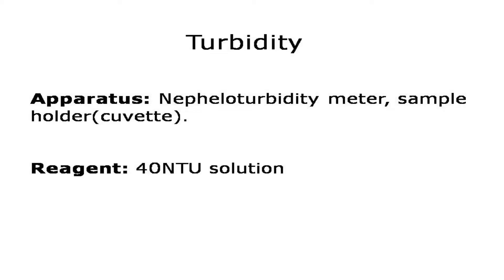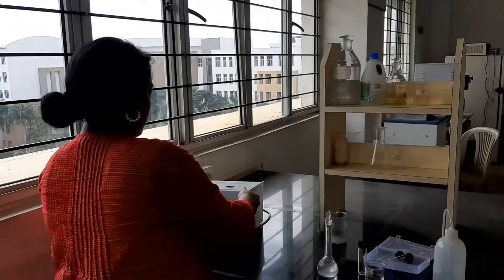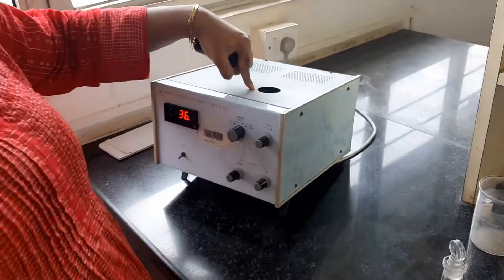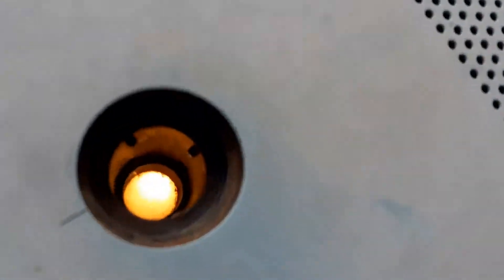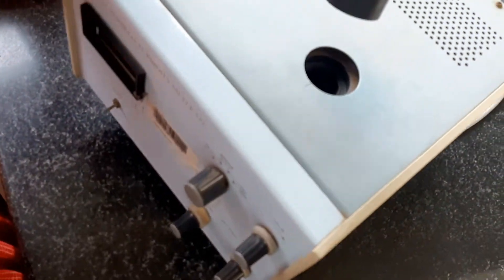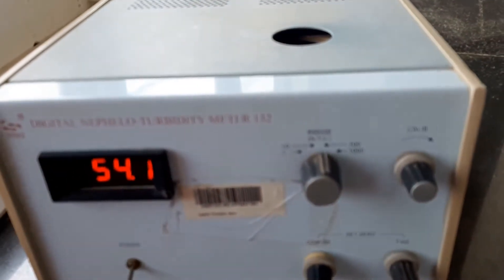Today we are going to calculate the turbidity of a given sample of water. For that we use a turbidity meter. When you put it on, there is a light source. We will be putting our sample solution here and then seeing what is the amount of dispersion in a liquid.